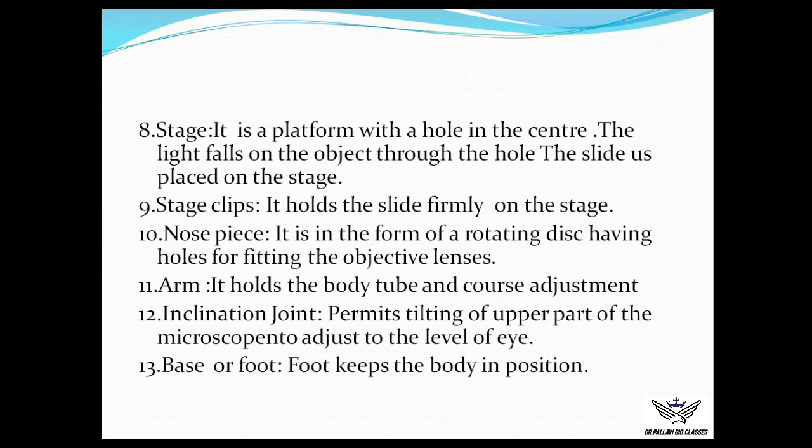Then stage clips are present. So these clips can be used for holding the slide firmly on the stage. Clips are present on both sides of the stage.